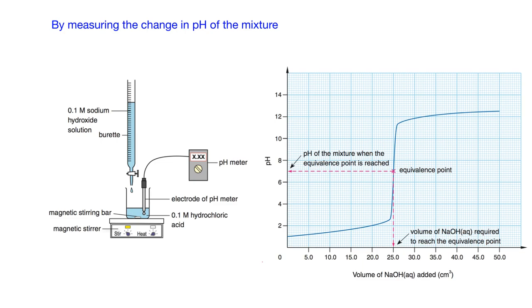First we're going to have a look at measuring the change in pH. This time, instead of using a conical flask, we are using a beaker. In the beaker we have a magnetic stirring bar, which will be attracted by the magnetic stirrer underneath, making the stirring bar spin to create swirls inside the solution. So you don't need to swirl the solution manually to mix the acid and alkali together. Instead of using an indicator, we use a pH meter with an electrode to measure the pH change throughout the process.